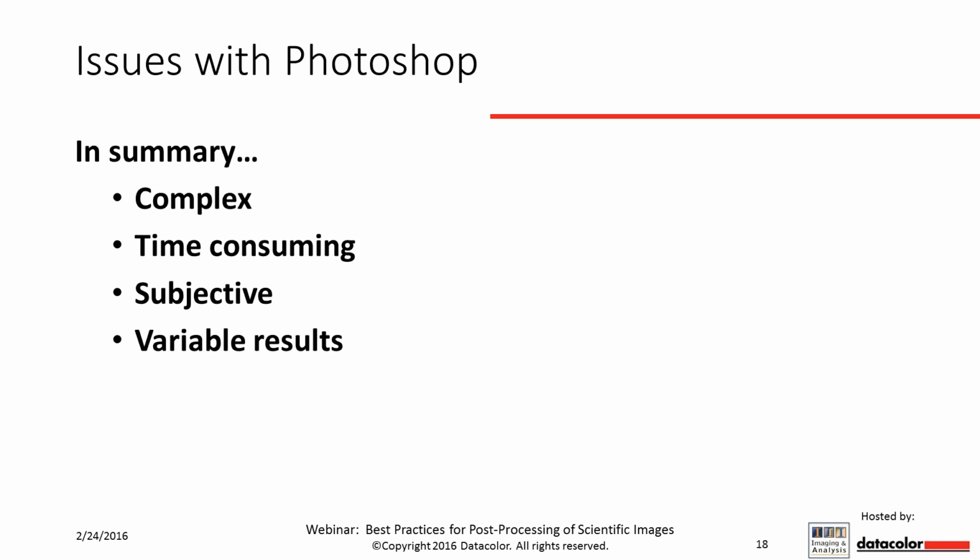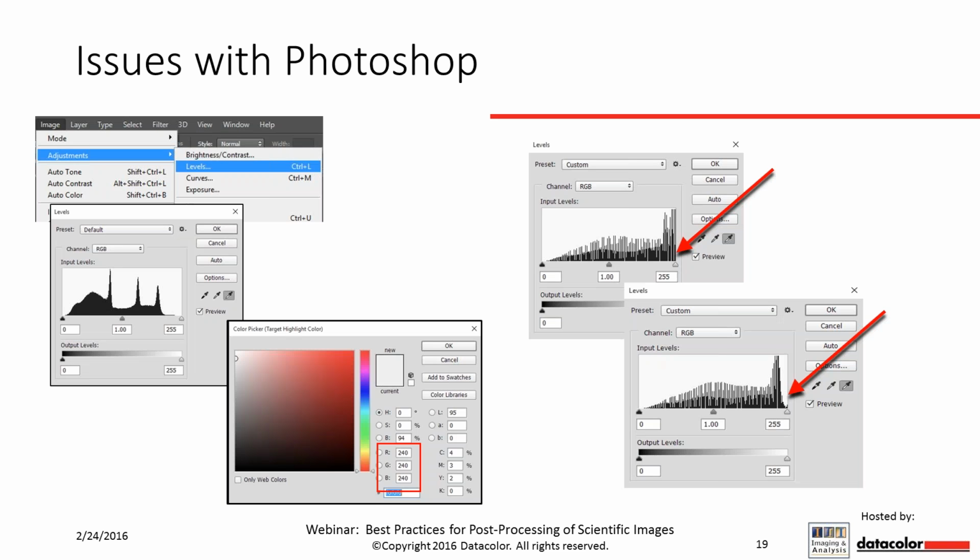Especially when deciding how you want color or how you want contrast. It can be subjective if you're not using proper techniques. And really, in the end, the thing that's really annoying for me is the variable results.